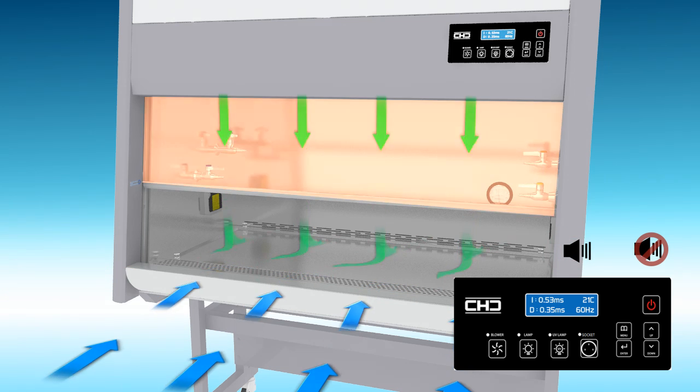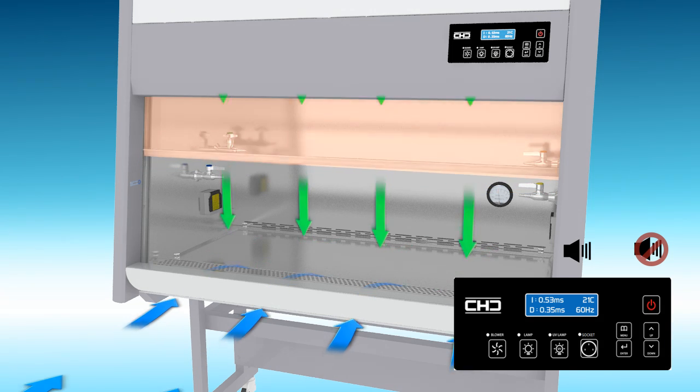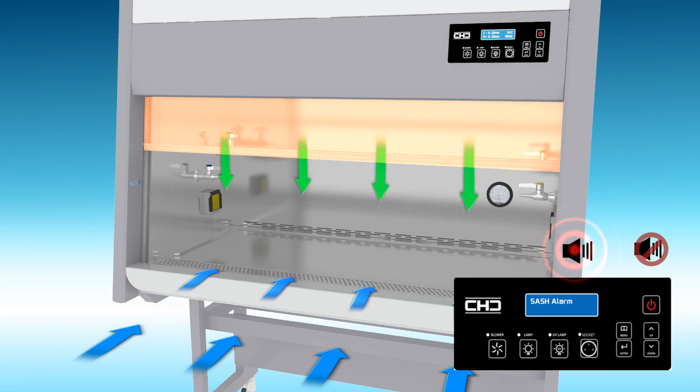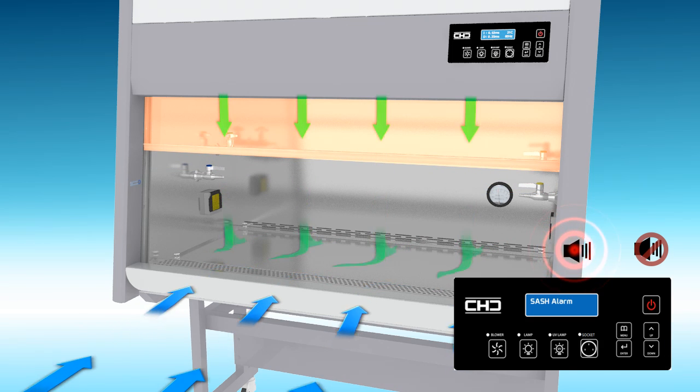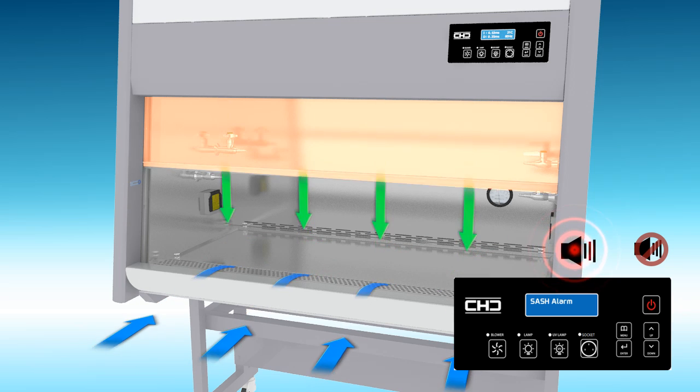Aside from this, sash alarm will be activated when sash level is out of the appropriate level. It may help the researcher to use the cabinet safely and easily.